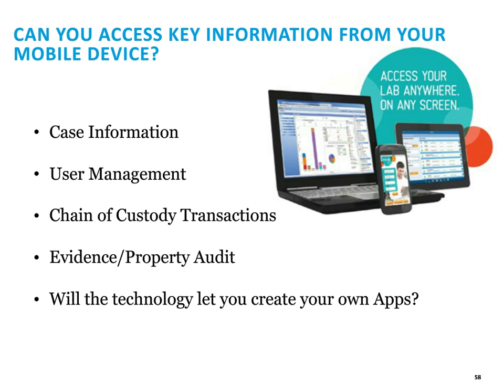And what about mobility? We all live today in a very mobile world. We all have our iPads or our cell phones and laptops. You should be looking for a vendor that's really moving in that direction. For example, maybe you're a crime lab director and you're at dinner and you get a really important call. You have a police chief.